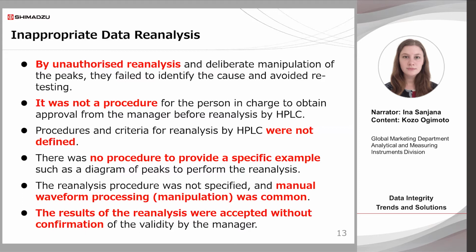The authorities point out that in one case, by unauthorized reanalysis and deliberate manipulation of the peaks, they failed to identify the cause and avoided retesting. This is an example of data falsification. In addition, when reanalysis is performed, approval from the manager must be obtained and procedures prepared.